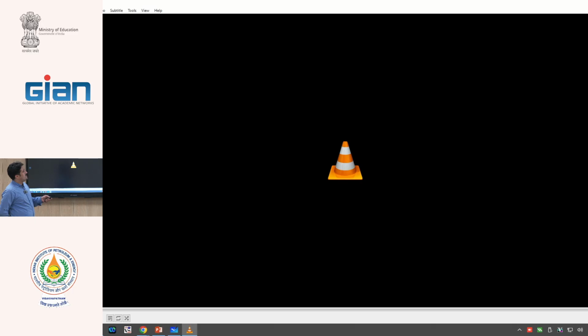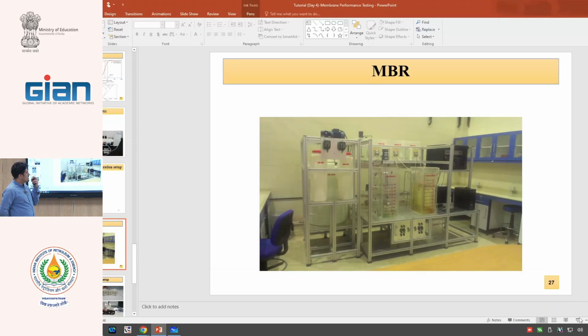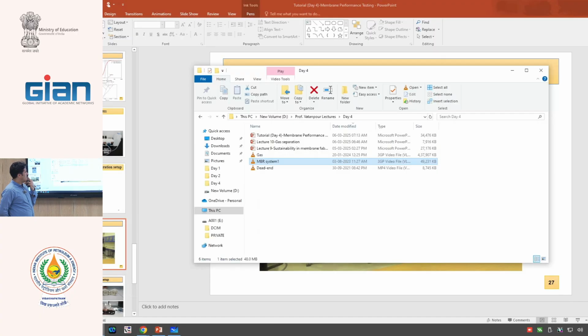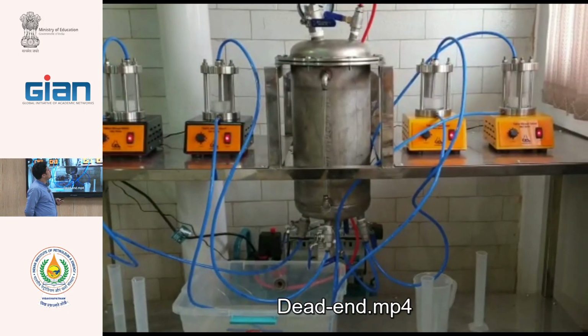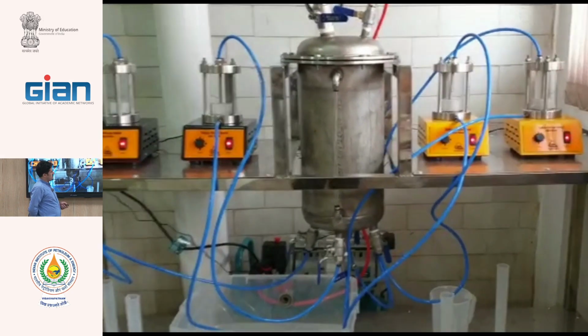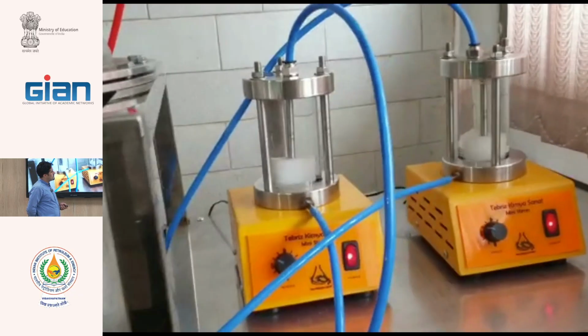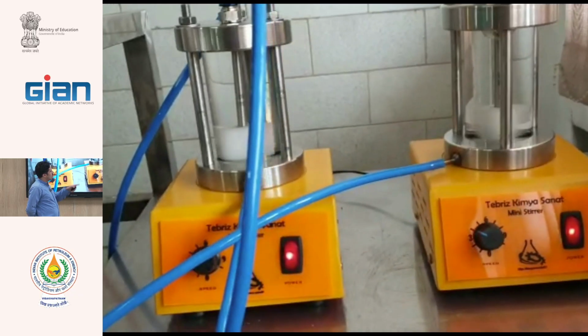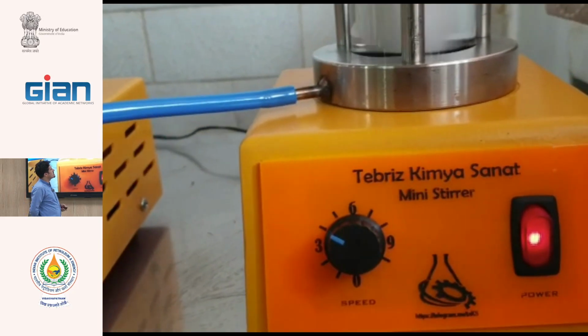Okay. The second film, dead end, video. Dead end. This is one of the cells in Iran for parallel. This stirring reduces concentration polarization.